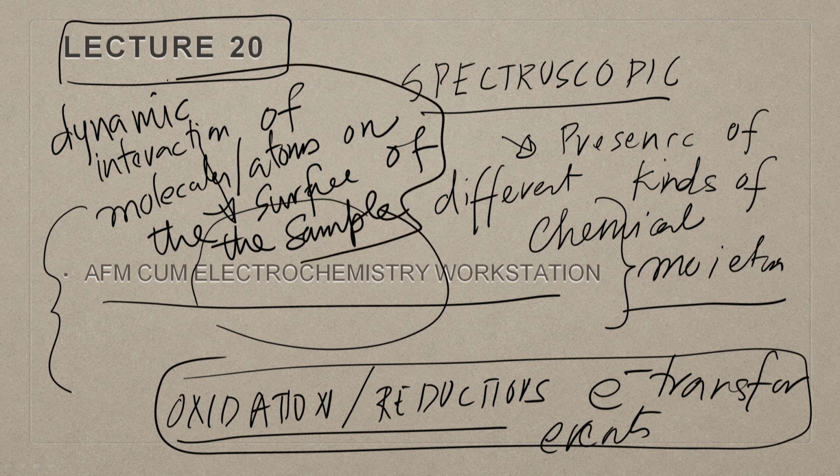So far, whatever we have talked about is the static presence of certain functional groups or a wide range of functional groups, topography, elasticity, bending, flexibility, three-dimensional geometry.